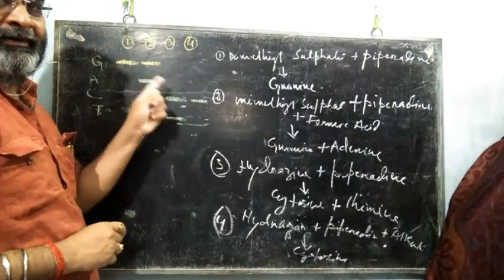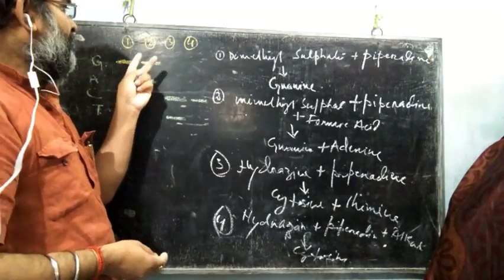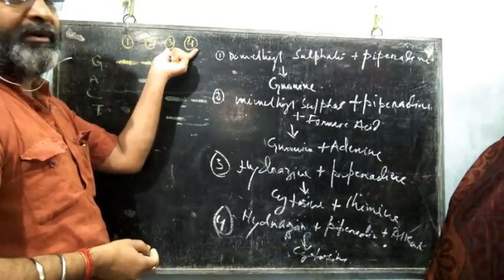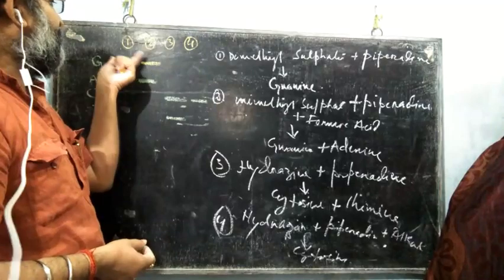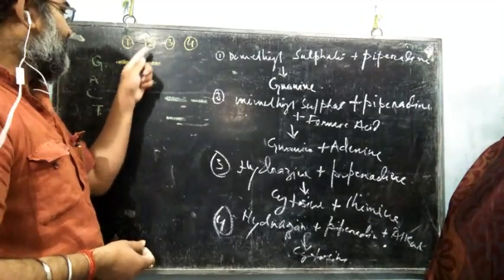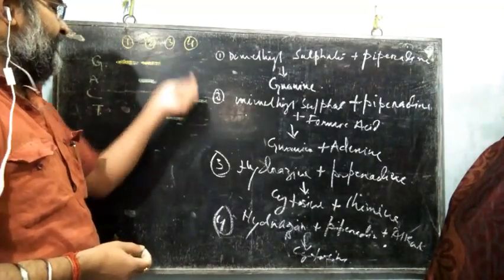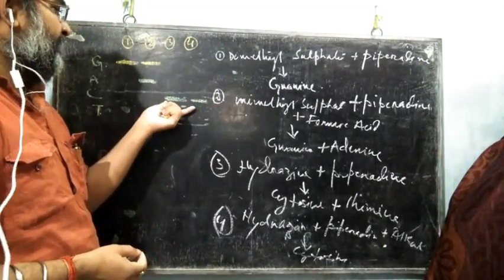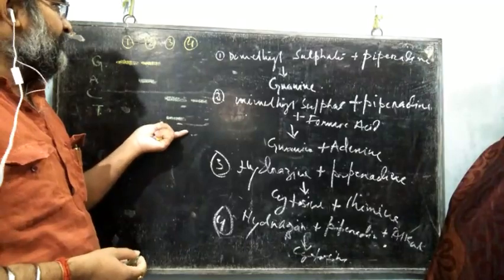It is the basic banding pattern. That means lines 1 and 2 represent the purine line and 3 and 4 represent the pyrimidine line. In the purine line, if bands are present in both first and second, it represents G. But if a band is present only in the second line, it represents A, adenylic deoxyribonucleotide. Likewise, if both bands are present in the third and fourth line, it is C, and T if the band appears only on the third line.